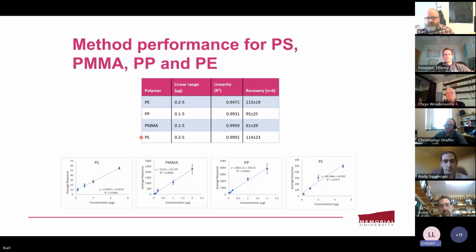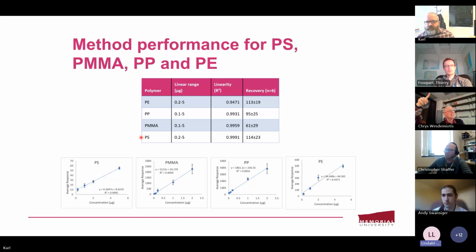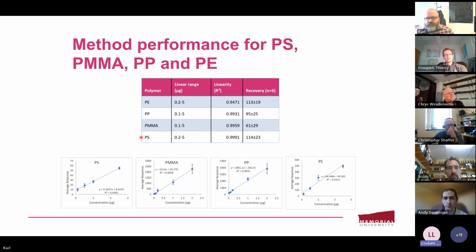You talked about suspensions, and I was curious if the calibrants used were water suspensions, or, you mentioned earlier doing a hot toluene extraction, and then later you found out you could do a methanol DCM suspension. My mind just keeps going to, these are all extractions and dissolutions and mixes thereof.